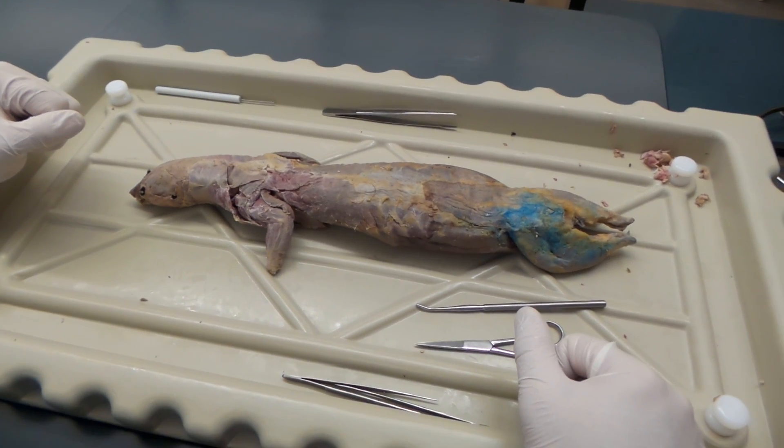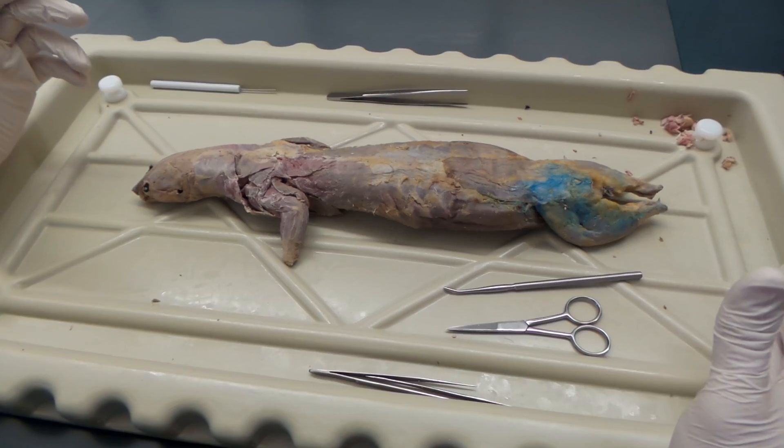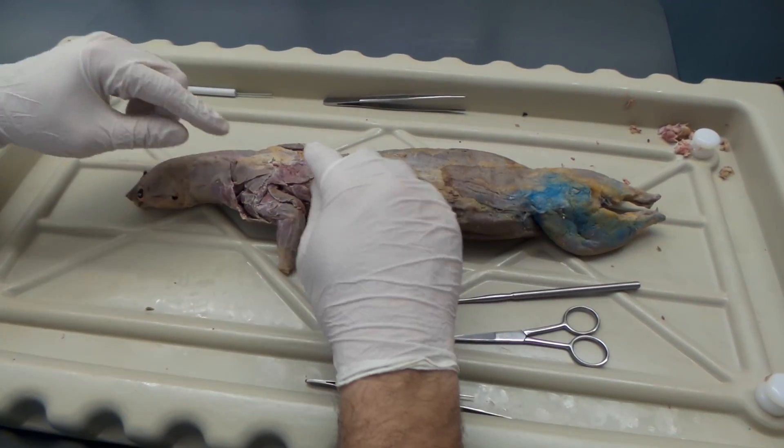This is day one Bio 210 lab. Once you've got your mink, the first thing you want to do is cut the tail off, remove a lot of the fat, and then we're going to start looking at some of the superficial muscles of the back.